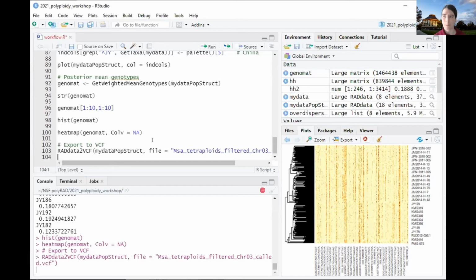No, no one has the budget for that. And the way the prior probabilities work is that the prior doesn't take into account the depth at that particular sample and locus, but the prior is looking at the whole rest of the data set, if that makes sense.